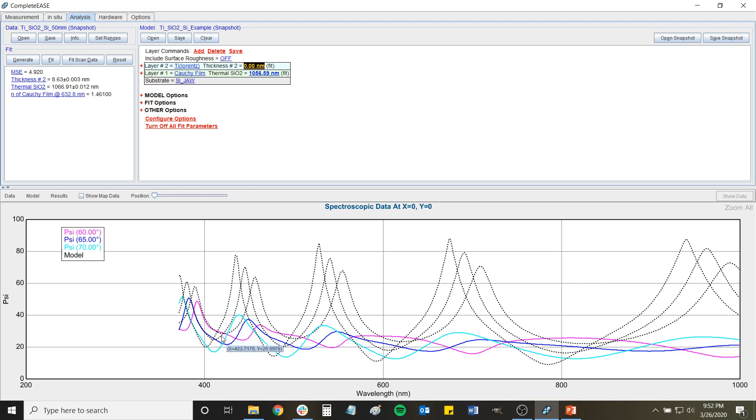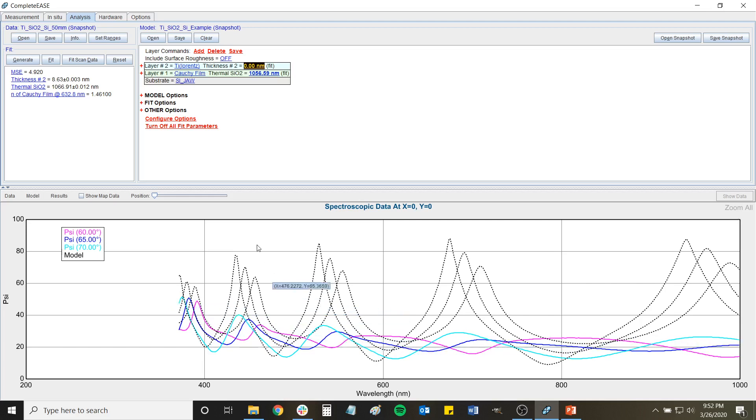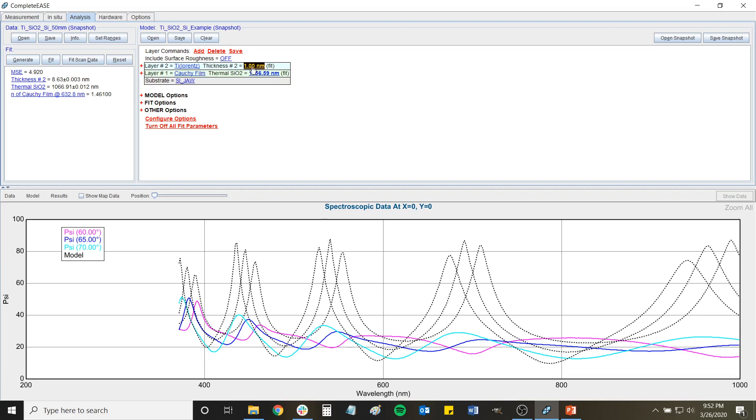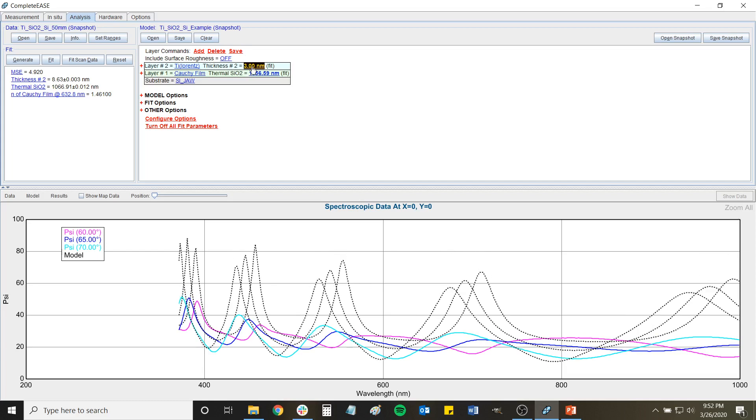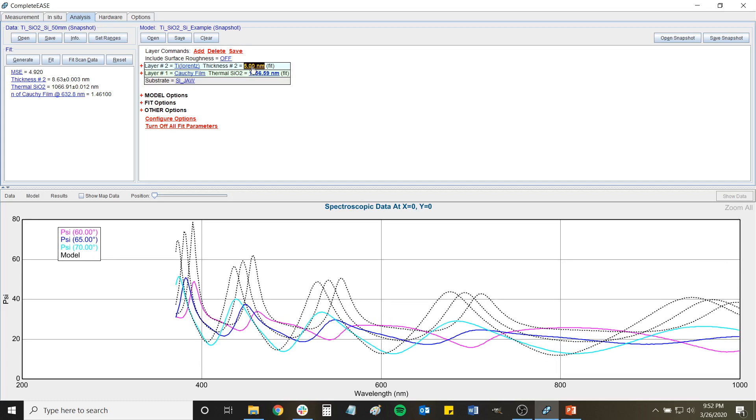And now you may notice that the result that we actually have, what the data actually looks like, is that the peaks are largely lined up but they're dampened. And so that's basically what happens - the presence of the metal on top of the dielectric dampens the intensity of the interference.